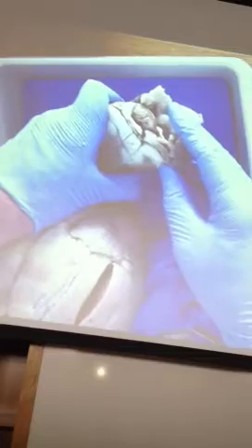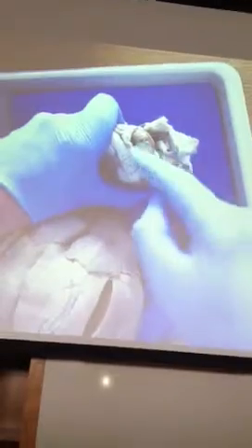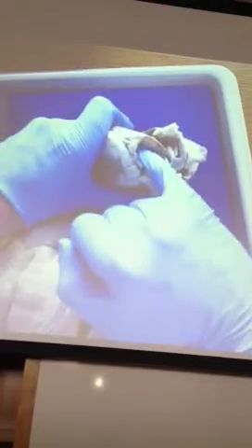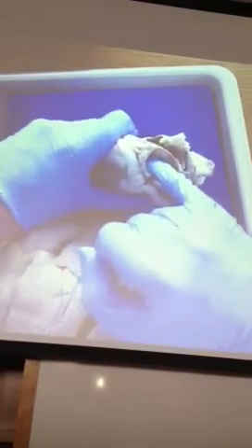When they cut this sheep heart out, they took a chop straight across, so you can't see the individual little branches. That represents the opening where the pulmonary veins have been cut off. So my finger now is inside of the left atrium. Now let me flip it over again.